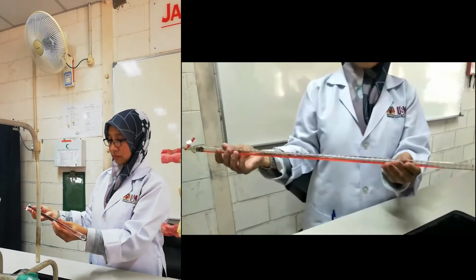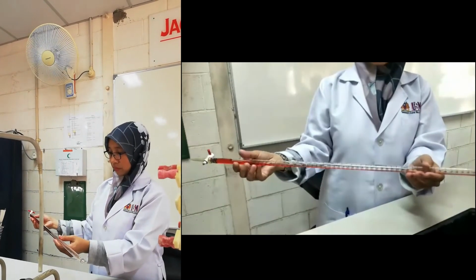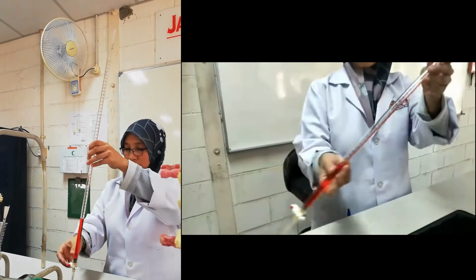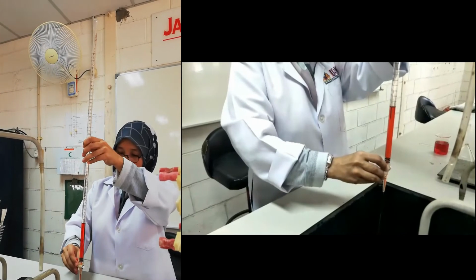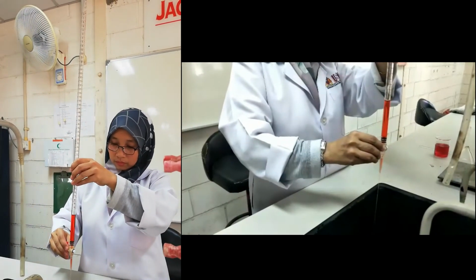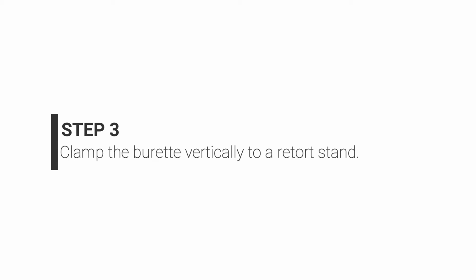Carefully hold the burette horizontally. Then rotate the burette so that the entire inner surface is coated with the solution. Open the stopcock to allow the solution to drain out through the burette tip. The burette is already rinsed and ready to use. Clamp the burette vertically to a retort stand.